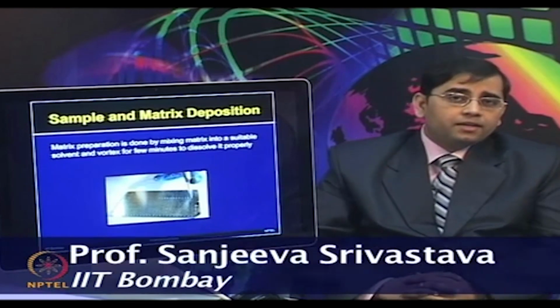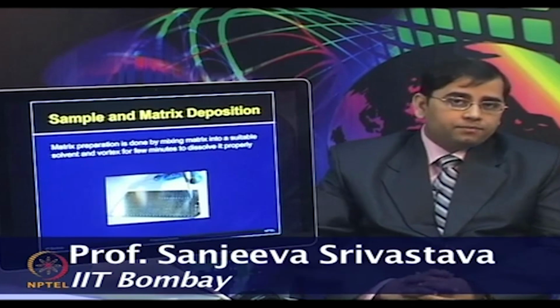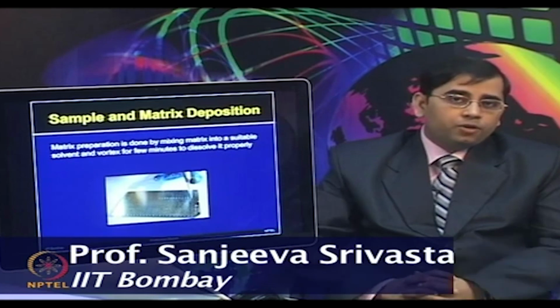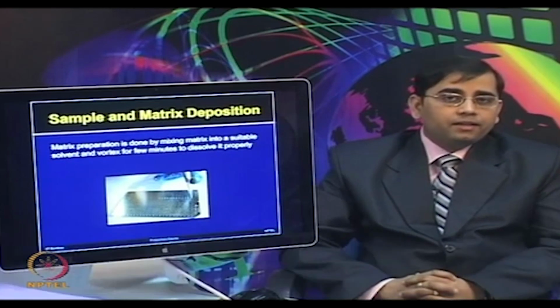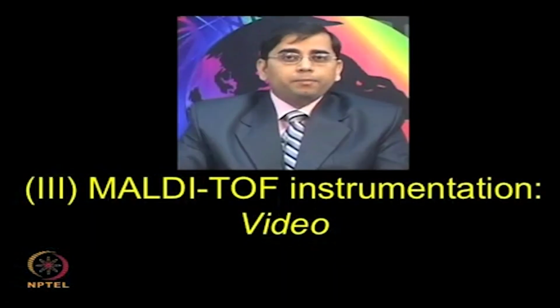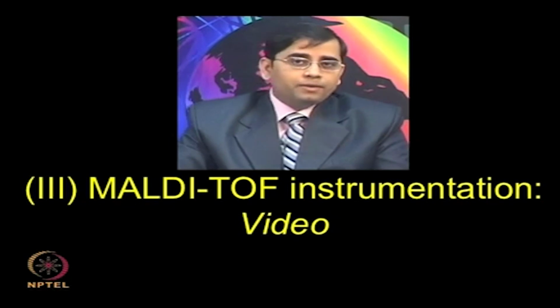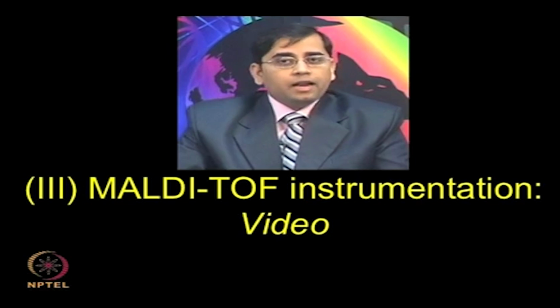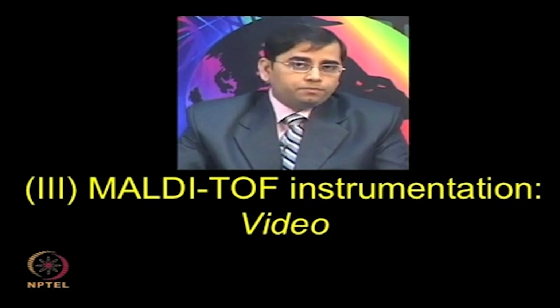So, one can try different combinations of placing the matrix and the analyte, and then once you have placed all of the samples of interest on the MALDI plate, you are ready to dry the target plate. After spotting is done, the MALDI plate is dried for almost 30 minutes. Then the instrument can be turned on and MS analysis can be performed.